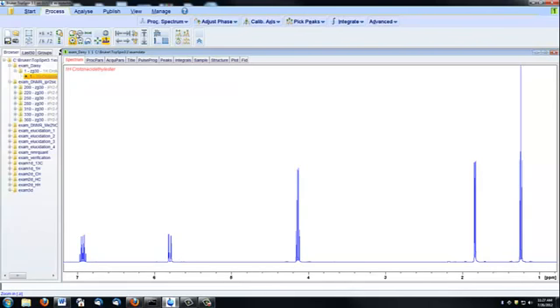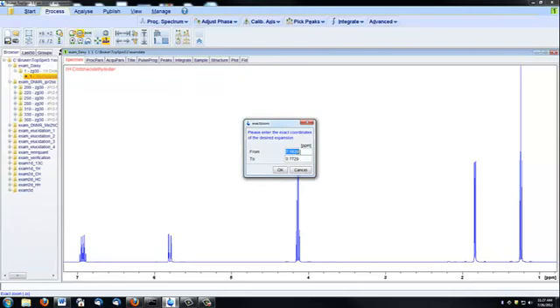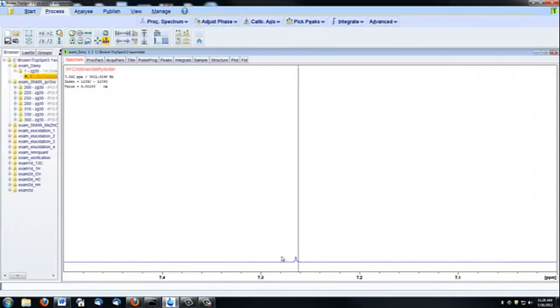If you know an exact region you want to zoom in on, you can click this ppm button and you can select a certain region. So for example, if I want to identify the chloroform peak, which I know falls at 7.27, I can set my range from 7.5 to 7.0, and that will zoom directly in on that region. And you can see right here we have chloroform.